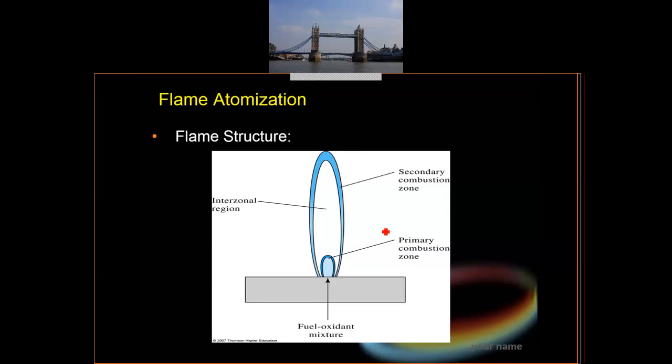And this is what's happening inside the flame. Okay? Imagine this is the opening, very small opening, and then there will be flame or fire coming out. All the sample, the mixed sample, the nebulized sample with oxidant and also with the fuel will be inside these two areas, not on the outside. This side and also this point. Okay, and it will be measured here.